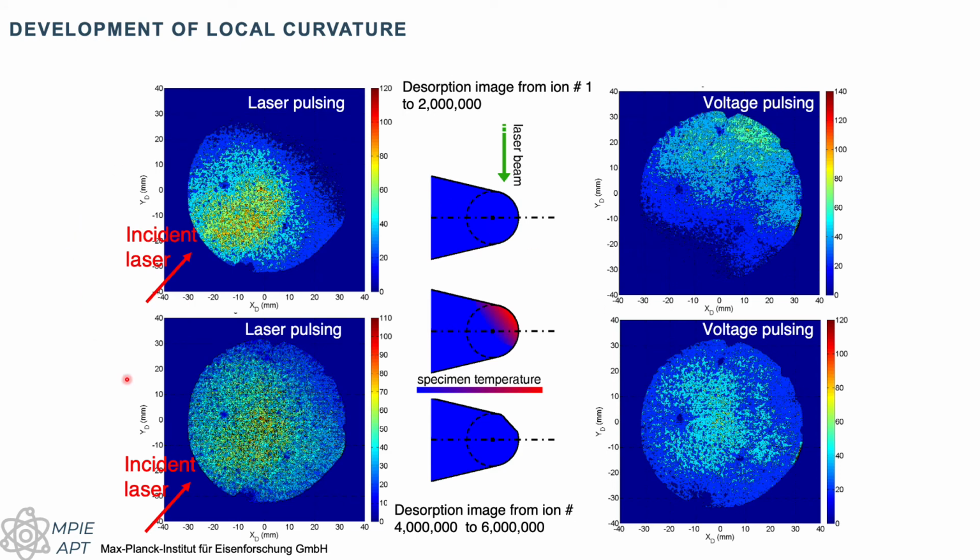For instance, Gongsha, when he was at the University of Sydney, did a series of experiments that was quite interesting. So he looked at using various laser powers, for example, and then start the run. And you could see that after some time we were field evaporating mostly with high density on one side, which is the side from which the laser was coming.